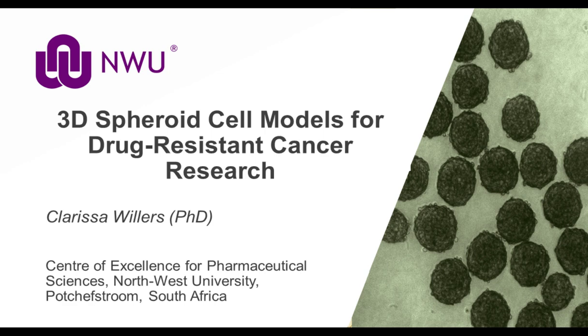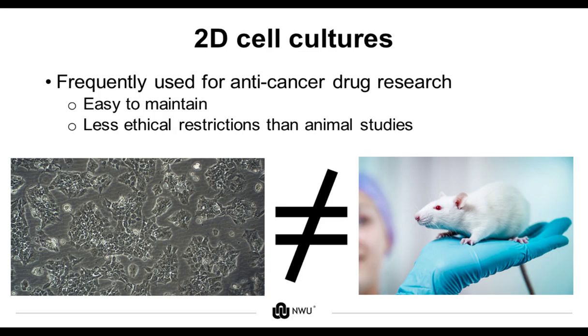At the Center of Excellence for Pharmaceutical Sciences, our cell culture research focuses on developing novel mammalian cell culture models for applications in drug research, mainly traditional African medicine and their possible interactions with conventional medicine. Side by side with our hosts, Dr. Krishna Gous and Prof. Sia Saman, my colleague, Dr. Carla Michalet, and I are currently establishing three-dimensional cell culture models for multi-drug resistant cancer research.